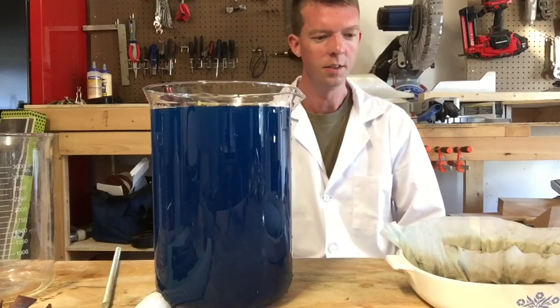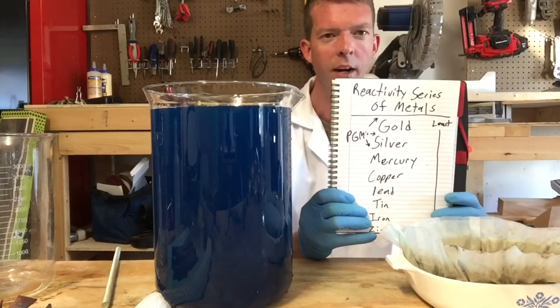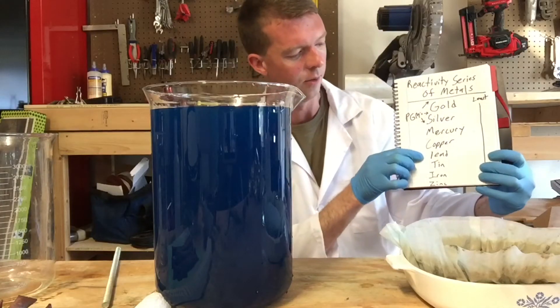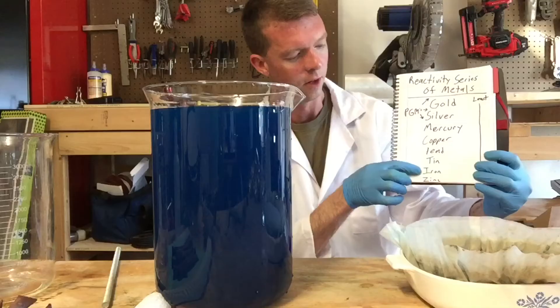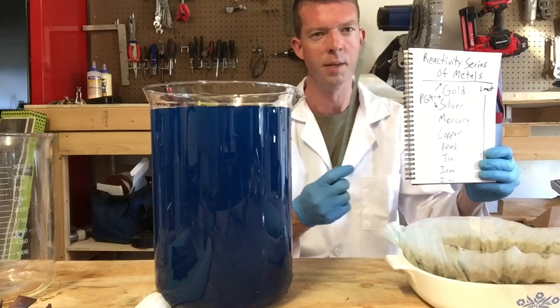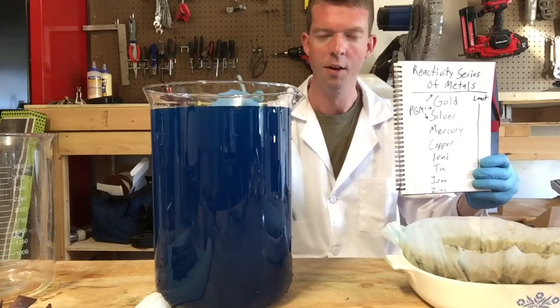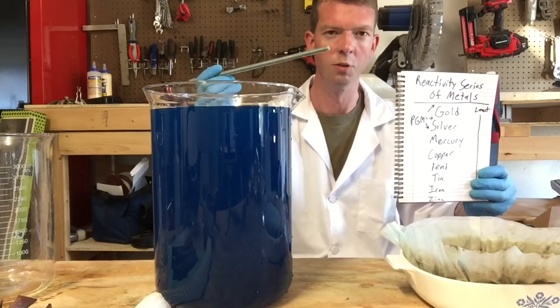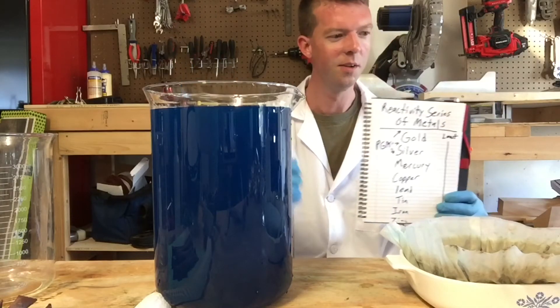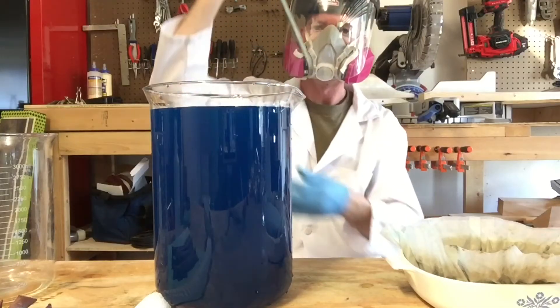We've just cemented out our silver using copper, so now we go back to our reactivity series of metals. All we have to do to get the copper out is keep going to the more reactive metals. I don't have any lead or tin, so we're going to have to use iron. What I have is a piece of steel — steel is made of iron and carbon — so once we put this in, the copper should react and crystallize into a copper powder while the steel starts to go into solution.